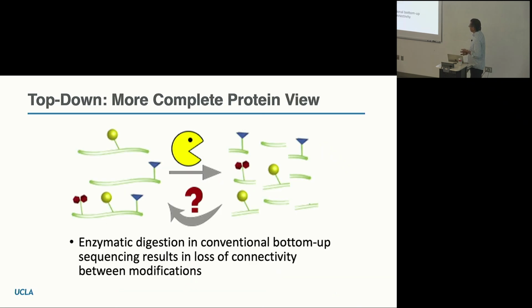The other justification is that, let's say I have a collection of 3 proteins, the same protein, same sequence, but one form of the protein has one modification, the second form has this other modification, and this third protein has 3 different modifications.